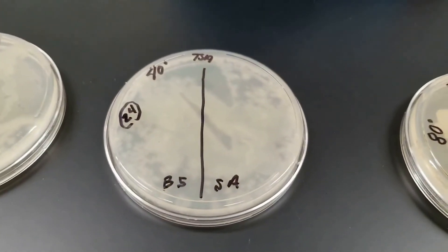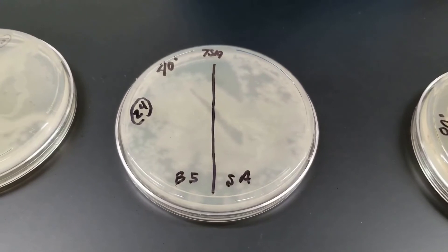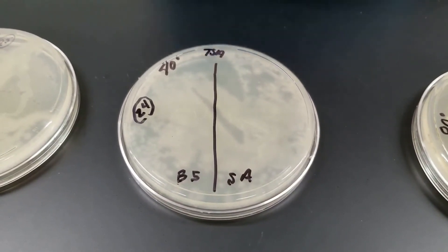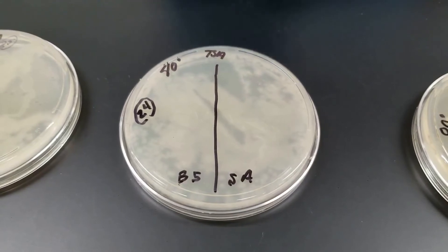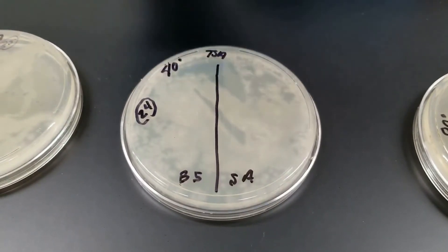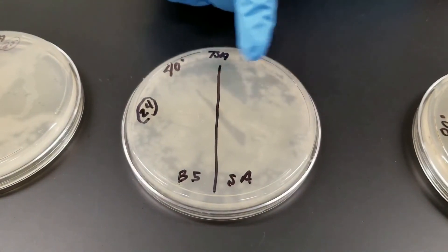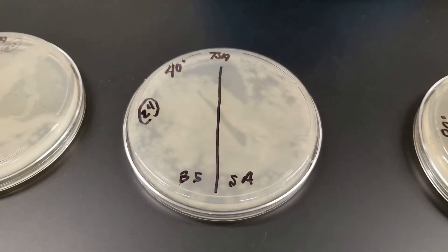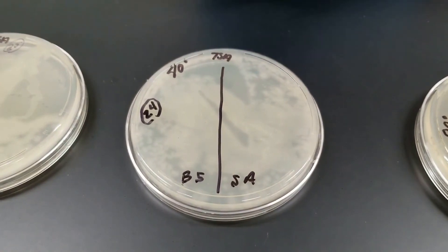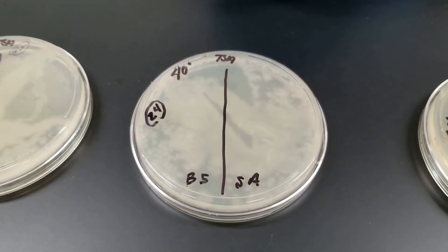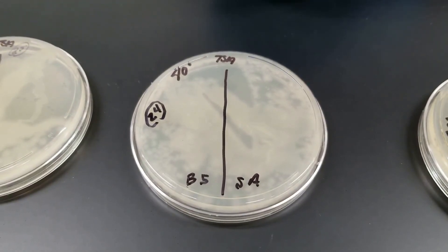The sample after having it at 40 degrees Celsius for 10 minutes, we streaked on the plate. Once again, same two cultures. So we have the Bacillus subtilis versus the Staphylococcus aureus. There's still some out-competition going on here. The Bacillus out-competed the staph aureus, but the point is you still had growth of both cultures at 40 degrees Celsius.